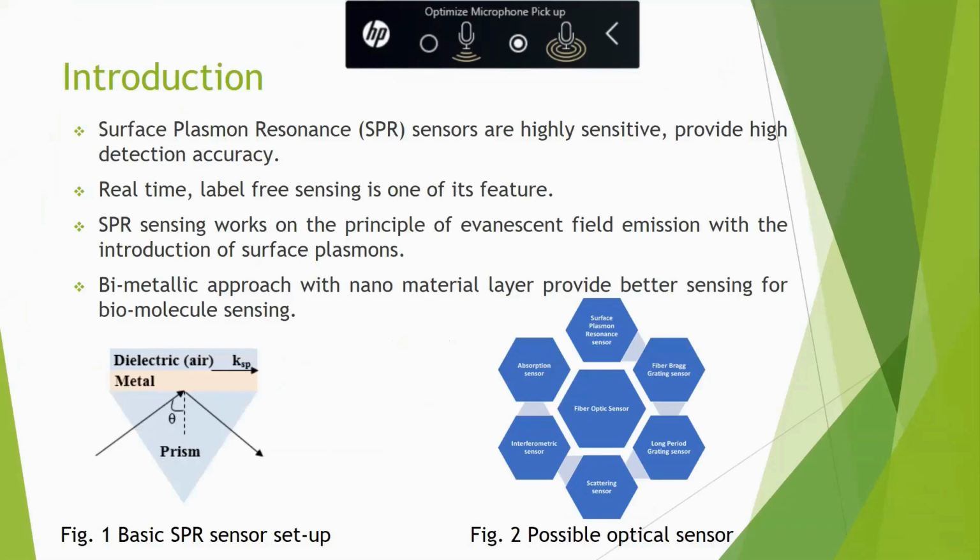Basically, SPR is the optical based principle through which we do the sensing for the refractive index change in the analyte, whatever analyte we are taking, and to make our sensor more and more selective, we need to use different layers, basically known as the BRE layer in terms of the sensor field. As in other optical sensors, we are going to use three stages. First is your BRE layer, basically where the analyte is going to sit and it will interact with the sensor.